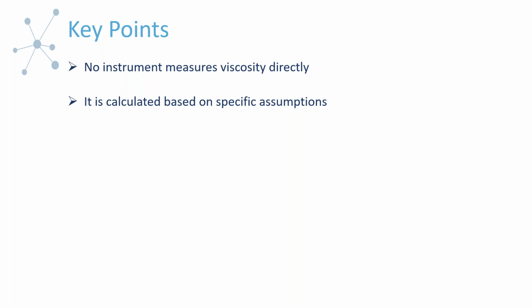This is where all viscosity or rheology instrumentation is on an equal playing field, because it's the nature of the measurement that this calculation process exists. Although the process, which is generally multi-step, is different for each piece of instrumentation, it is still true nonetheless. So when you say viscosity measurement, it's a bit of a misnomer.